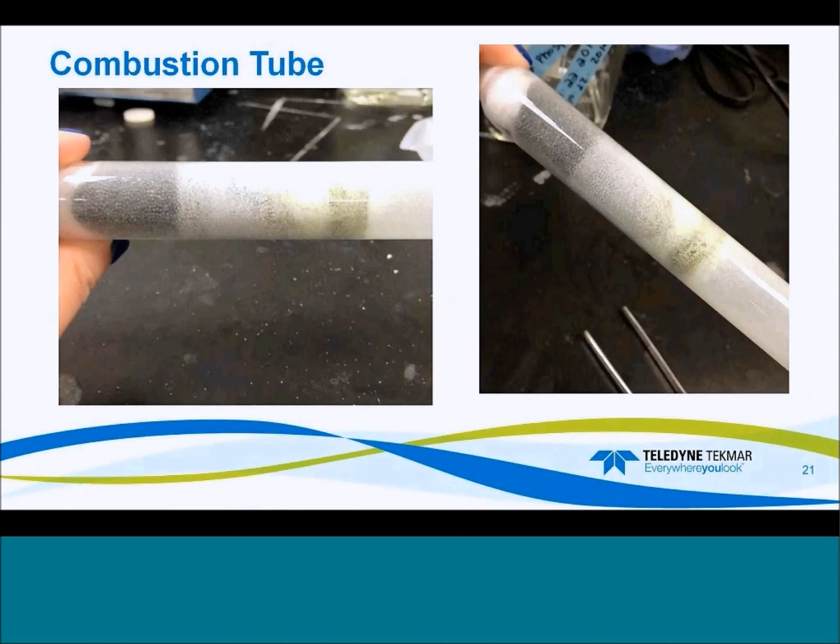In addition to changing the combustion tube, at the bottom of the combustion tube there are fittings, and it's good to make sure that those are cleaned out and they don't have any salt that might have blocked it. I didn't have any issues when I ran mine, but I did take it out and look at it and make sure that everything looked as it should. Look for anything else that might be wrong, any salt that could be someplace else.